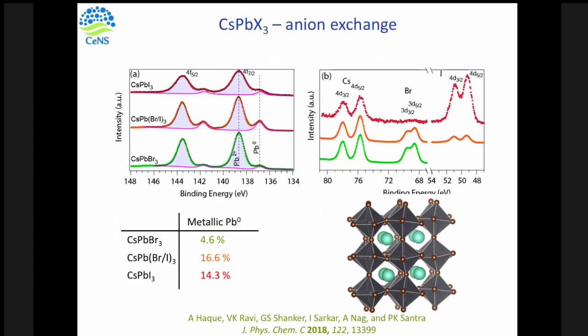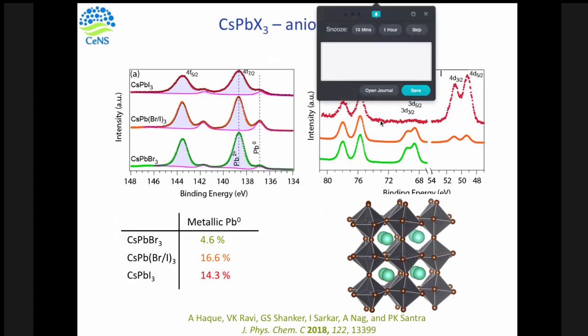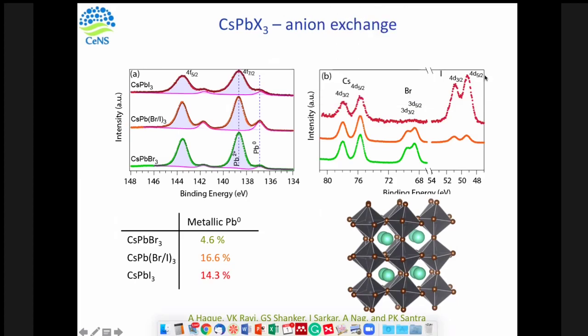Correct. We are only a decade, maybe a little bit more. But earlier, what people used to do was use the same photon energy in the lab sources, but then keep on sputtering. So you are doing XPS, which is surface sensitive, and after you got the data, you use argon sputtering, take some sample off the surface, and then do it again. So that was a destructive method. But here, instead of argon sputtering, you are just changing the probe and thus probing this heterostructure.